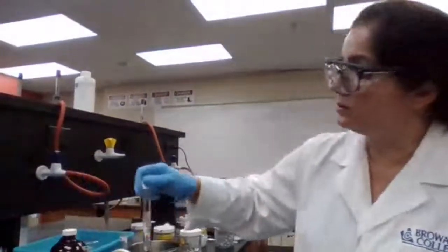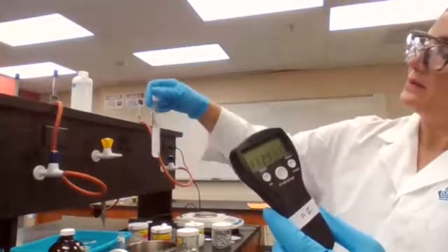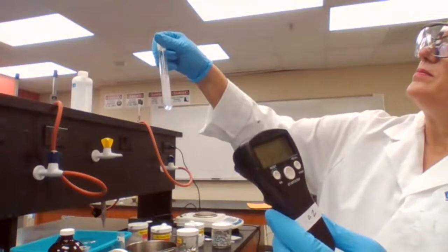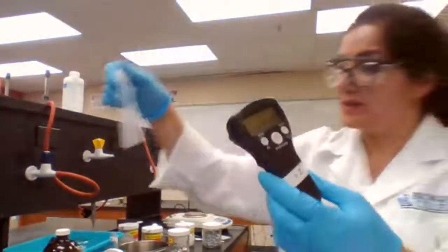Okay, the 0.2 is taking sweet time. It has been 1100 seconds and still reacting. I cannot stop the reaction. I'm just going to wait until it's done. But while it's going, I can prepare for my next step, which is 3 milliliters of potassium permanganate.